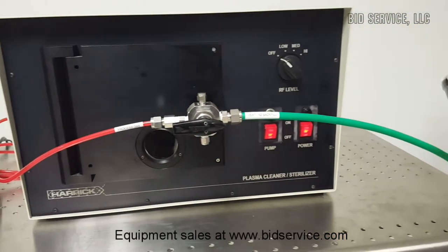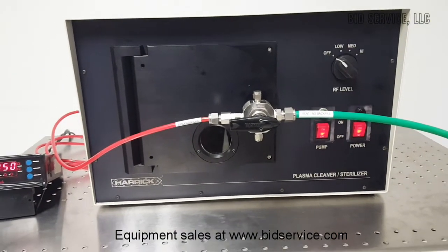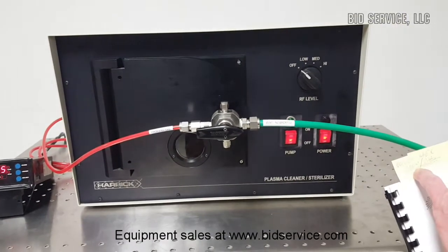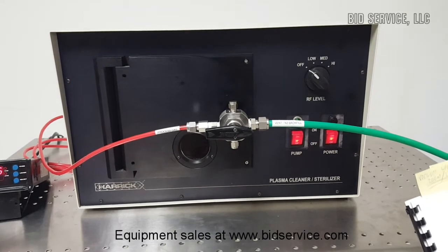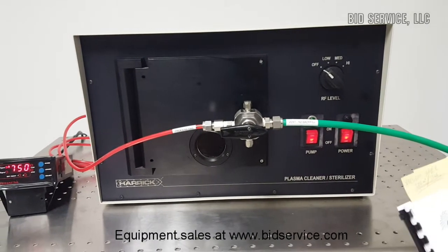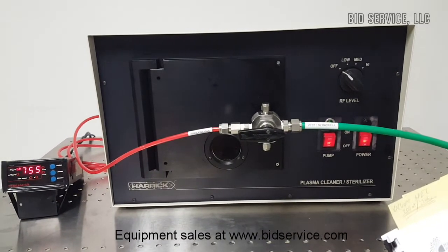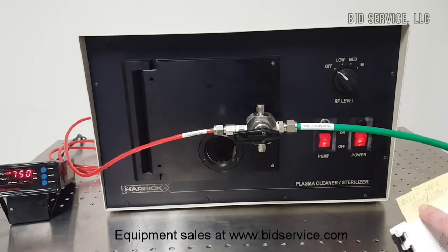When you select your vacuum pump, it should be able to at least achieve 200 millitorr. This is because processing with different gases — whether it be argon, oxygen, or others — can be done in ranges from 300 to 1,500 millitorr. So it is good to have a pump that can at least achieve 200 millitorr.